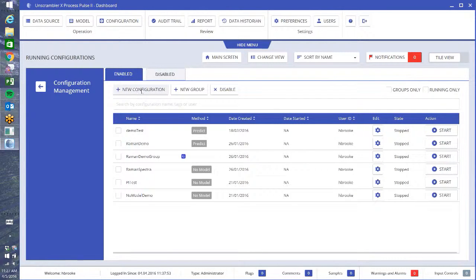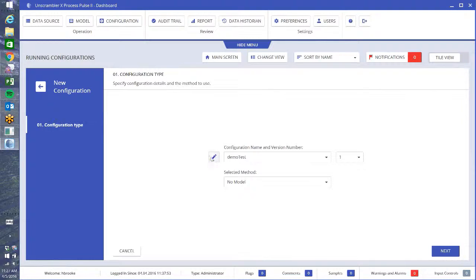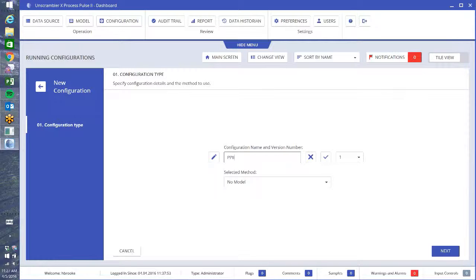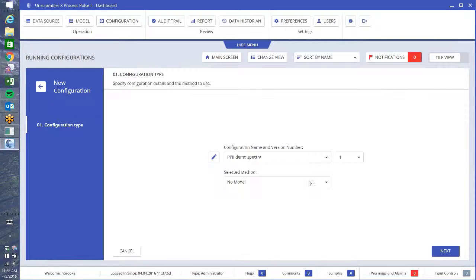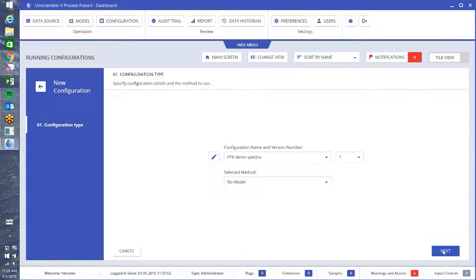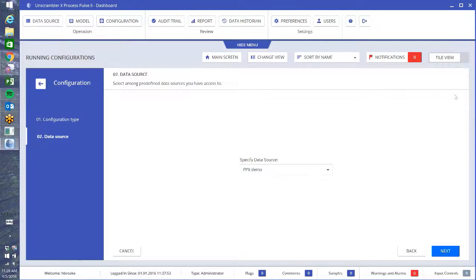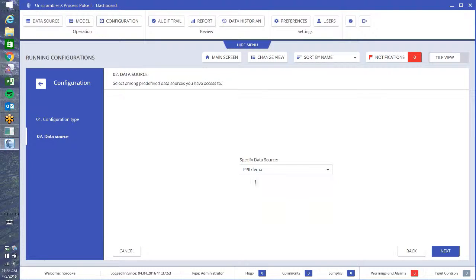Now what we want to do is create a new configuration. I'm going to make two real quick just so you can see a couple of options. The first thing I need to do is hit edit here so that I can make a new name, so Process Pulse 2 Demo Spectra, say OK. It automatically assigns the revision and I'm going to do no model here just so that it's just purely showing the data as it's coming in. Next, again we have some options. I find my data source, my drop down is any data source I have in here. I want to use my Process Pulse 2 Demo.